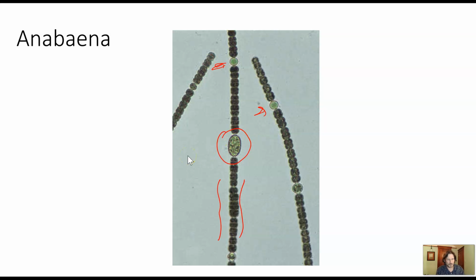So you see the heterocysts here are the ones that are lighter green. That's another heterocyst. You can also say that they're slightly like 1.5 times the size of the somatic cell. Akinetes are more like 3 times as big. And notice they're not clear. You see a lot of cytoplasm in them. They become very densely packed with cytoplasm. They have to change their cytoplasm as well as the cell wall material in order to survive either freezing or drying out. So they're doing something that will protect them. They're not actively growing.